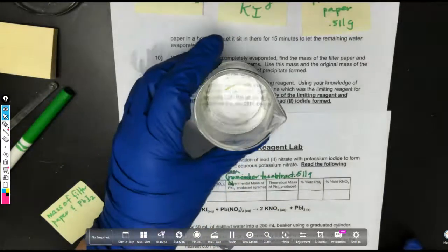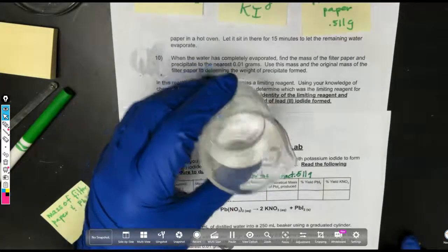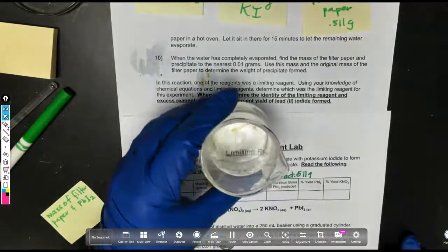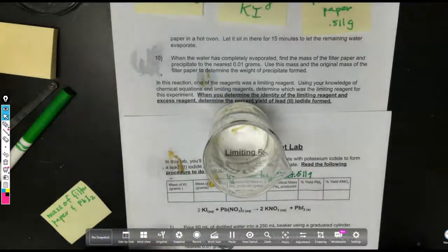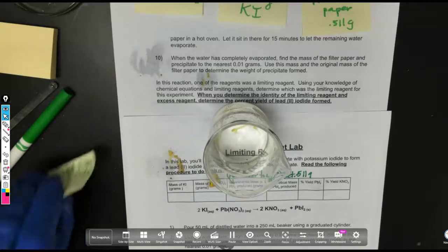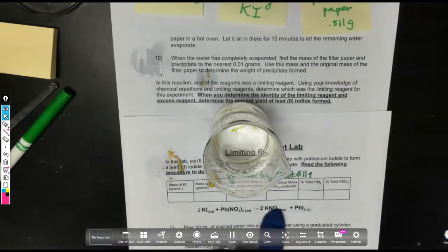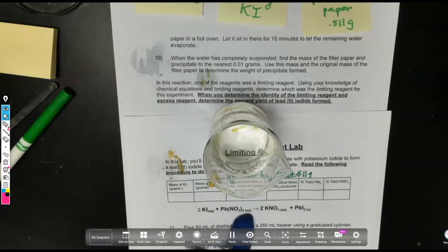And we're going to do that by trying to obtain the crystals of what was dissolved in here. Now, you and I both know that there are no crystals that you can see. There is nothing there. It is empty. It appears to just be water. And I can tell you for sure that this is not water. This is a solution of water and KNO3, as well as one of these two remaining as the excess reactant.